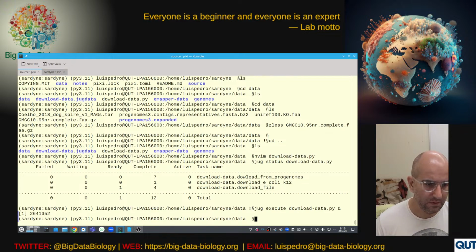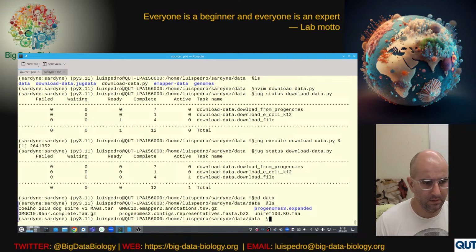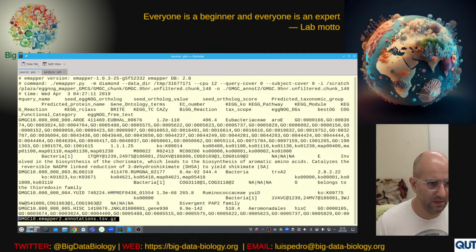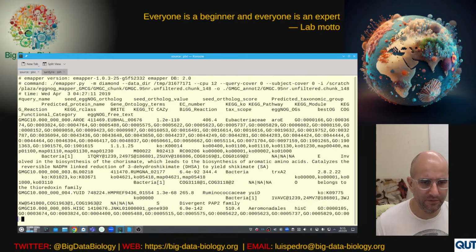It's still downloading, but you can see here, for example, this is not a complete gene, I believe. So we will have to filter this one out later. We'll do a bit of filtering, a bit of eggnog annotations. Not sure. Maybe. Let's see.